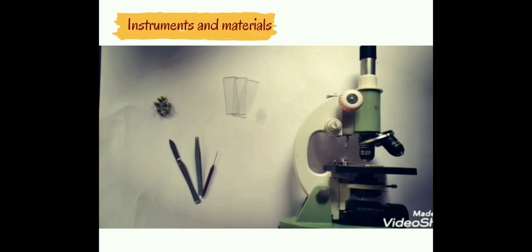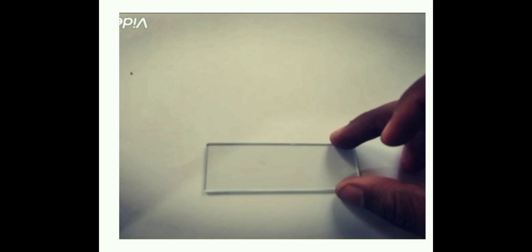Take a clean glass slide and try to dissect the Tridax inflorescence in order to get the individual florets which contain the embryo. Dissect the inflorescence with the help of forceps and needles.